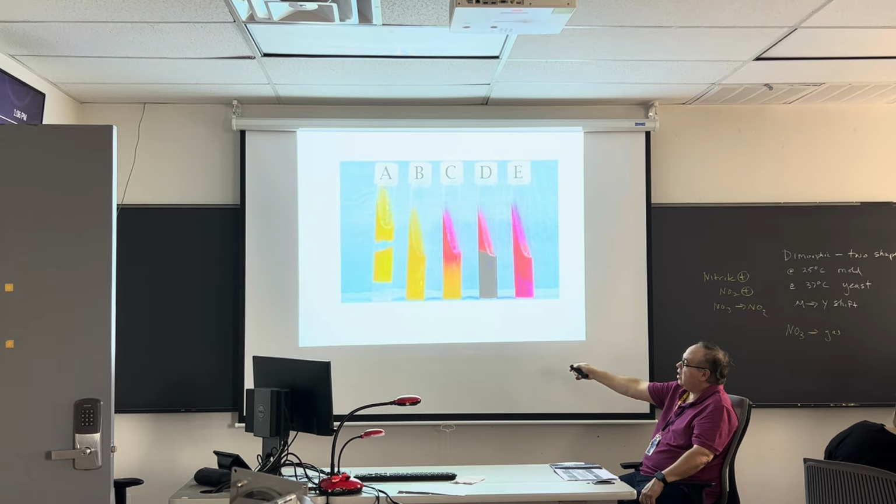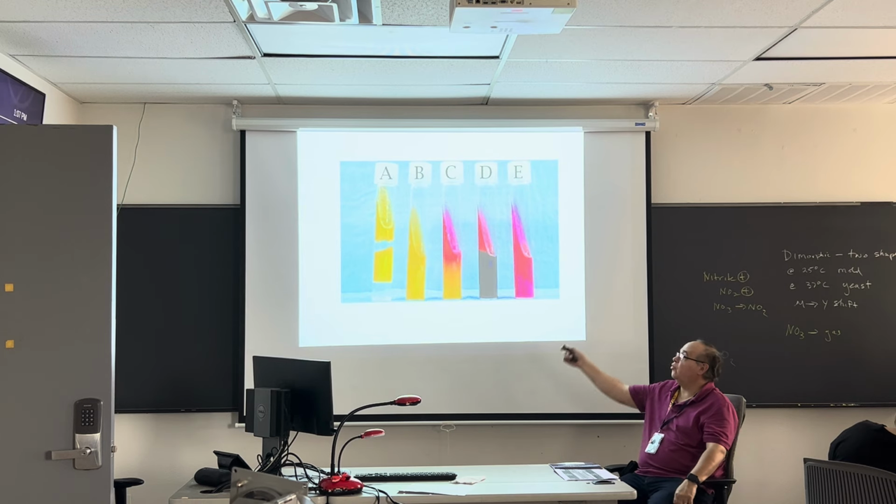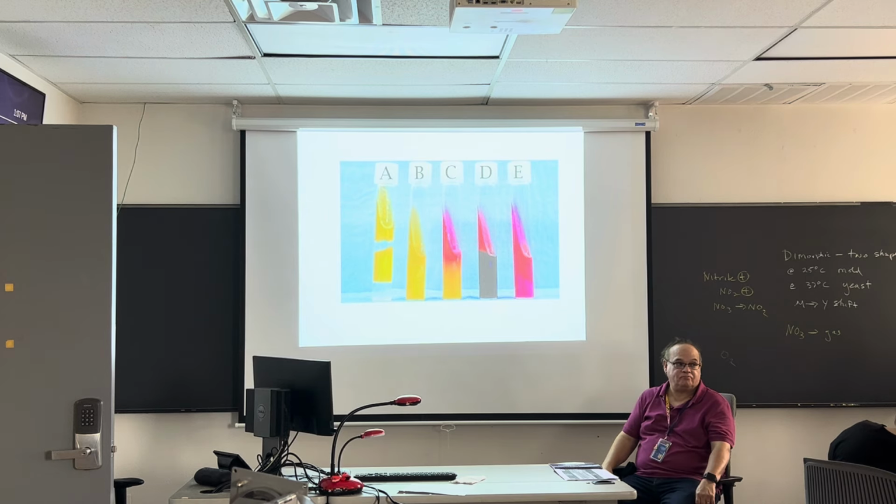A gas. Very good. What about here? I've got fuchsia there. I've got black there. Go. K, and no, it has to be A, because the rule is gas can only be produced in acidic conditions. That's hydrogen sulfide. It is a gas. Therefore, this is K, A, H2S. Okay? Good.